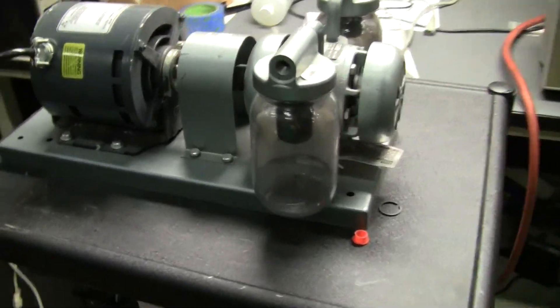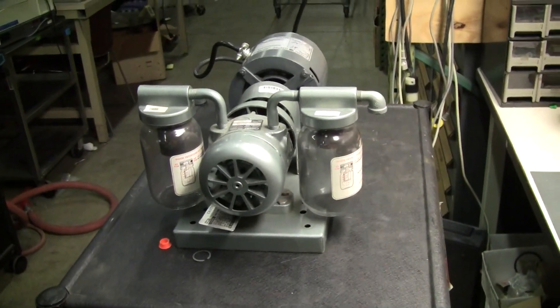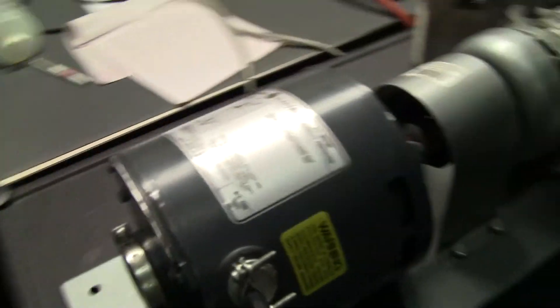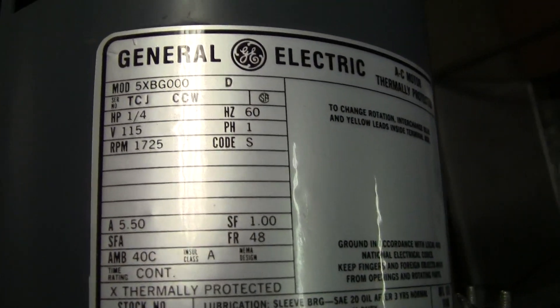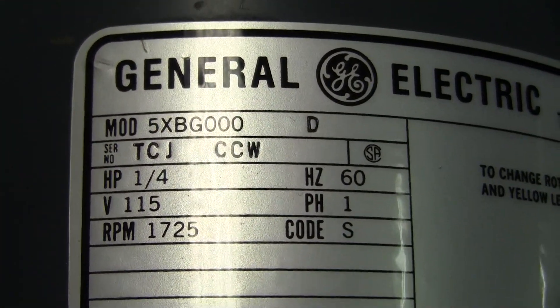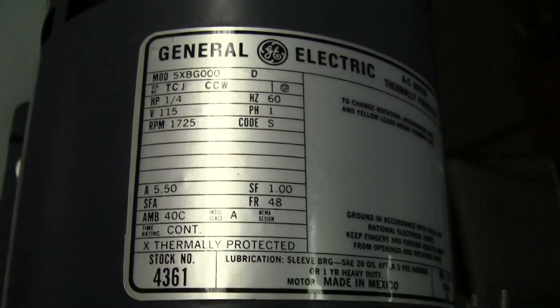Hi, this is Cody Young from Hitech Trader. Today we are looking at a gas oil-free vacuum pump. This vacuum pump has a quarter horsepower motor, General Electric. You can see the model number and the specs: 60 Hertz, 115 volts, gets up to 1700 RPMs.